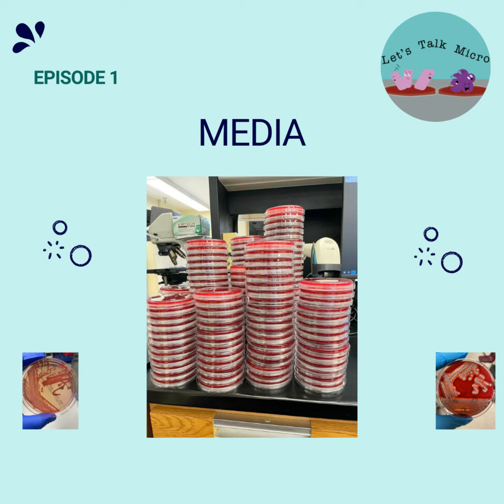And then we have differential media, which has ingredients that allow some colonies to exhibit characteristics that make them different from other colonies growing on the same plate. We have two great examples. Blood agar, which is differential for hemolysis, right? And what is hemolysis? It's a lysis of red blood cells.